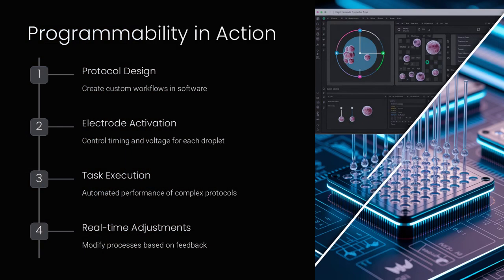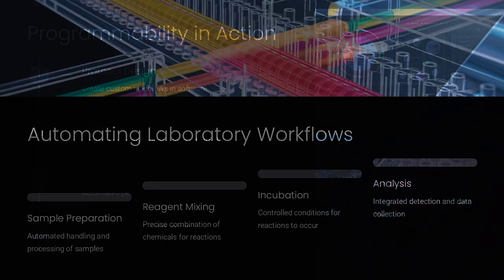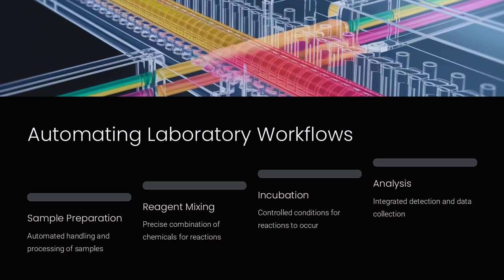In a lab setting, a technician uses a digital microfluidic platform to merge two droplets containing different chemicals, triggering a reaction that can be monitored in real time. Think of it as playing a digital game where each move directs a small ball along a grid, combining with other balls to achieve a specific goal.